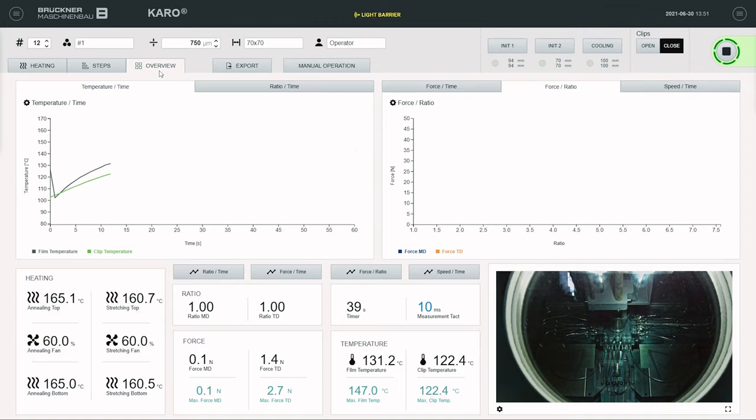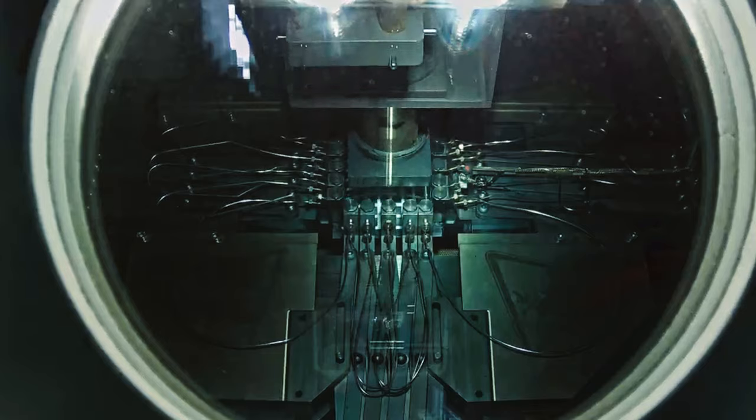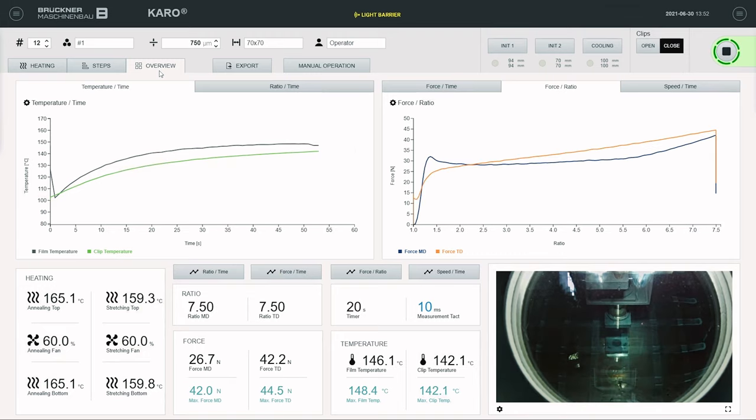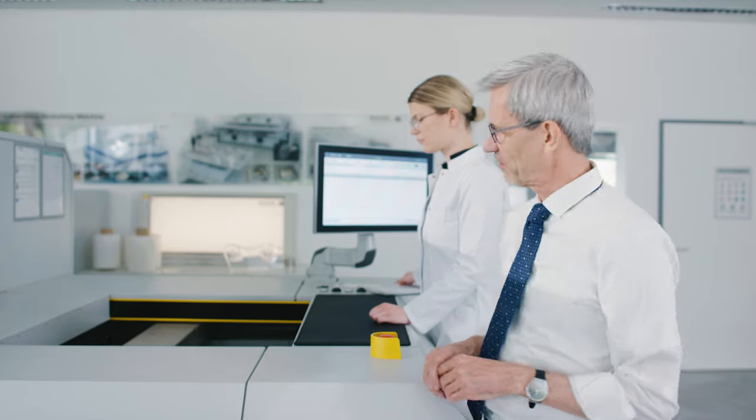During this process, you can observe the actual film temperature of the sample at any time. This is measured with an infrared pyrometer inside the oven and displayed on the graph. As the film has now reached the correct temperature, the diffuser is moving away and the stretching begins — first in MD and after that in TD. During this process, the stretching forces are always measured, recorded and displayed on the screen. And once the stretching is finished, the film returns to the inlet and Christina can easily remove the sample. The film is equally stretched and is ready for further analysis in the laboratory.